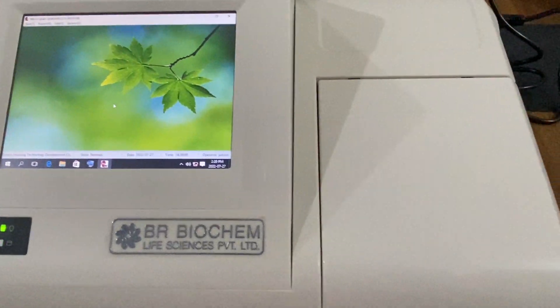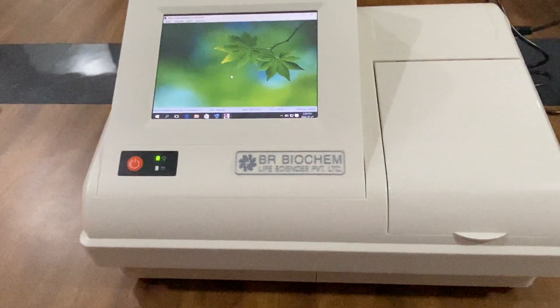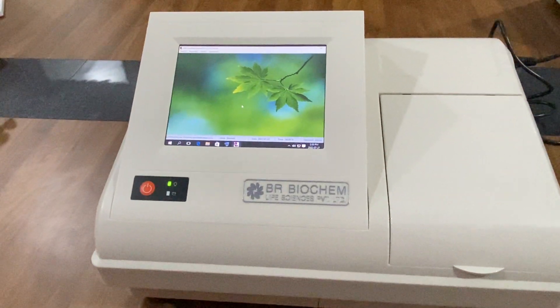In this ELISA reader, you can insert a 48-well microplate as well as a 96-well microplate.